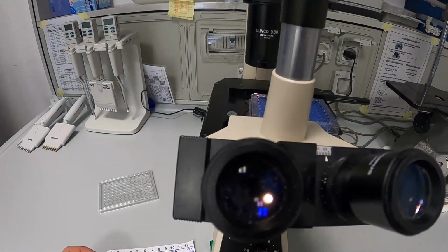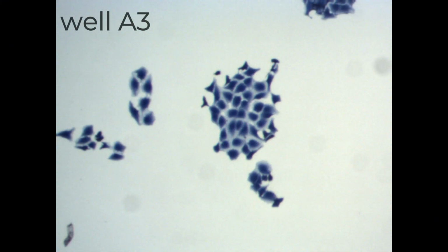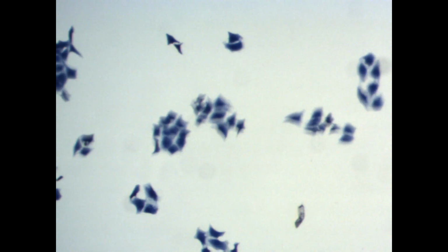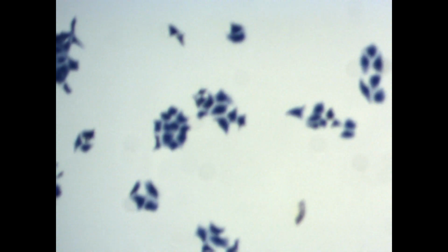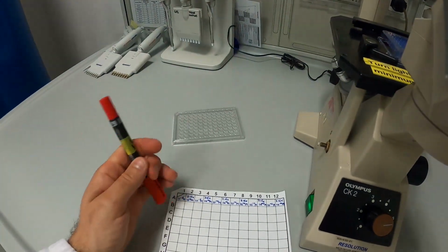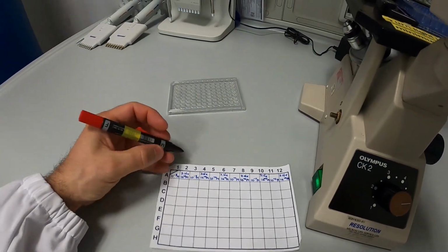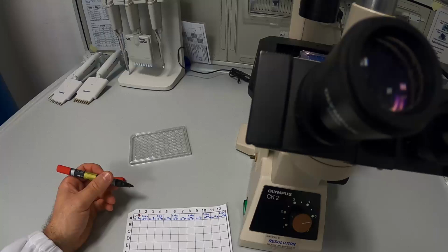Okay, now let's zoom in a little bit on the colony. So change the magnification, increase the magnification. Keep adjusting the focus plane and move through the well to see all the cells, to see all the colonies and get a general overview of the state of cell activation. They look very beautiful. Okay, record your observation. A1 was definitely positive, so put a plus in that well. Go back and keep checking each well.